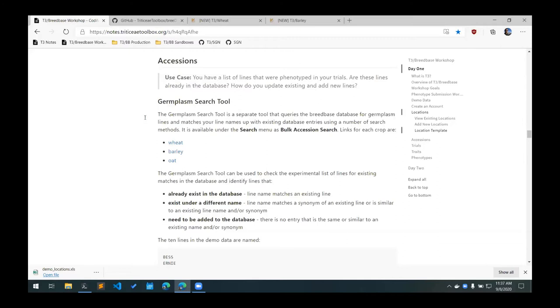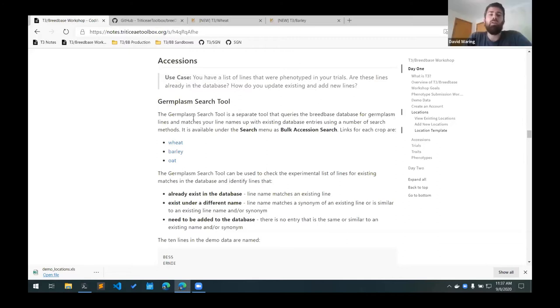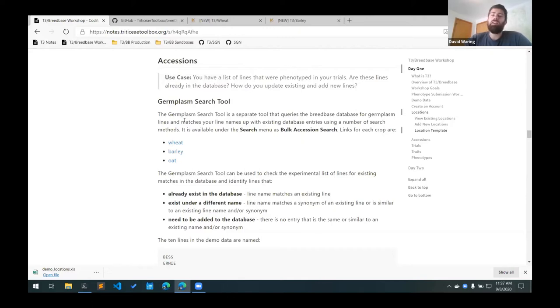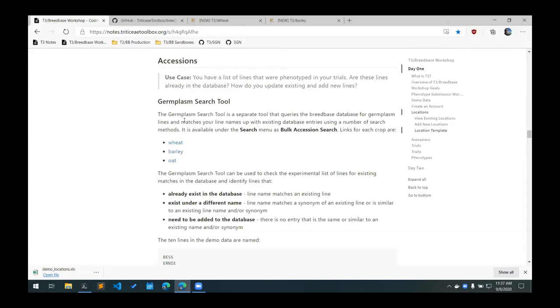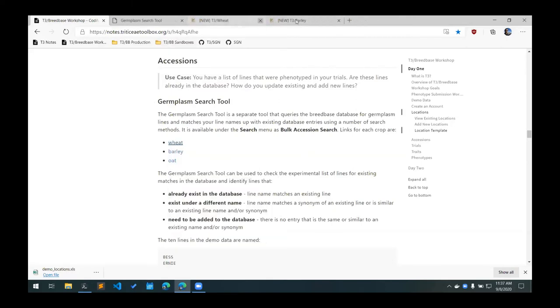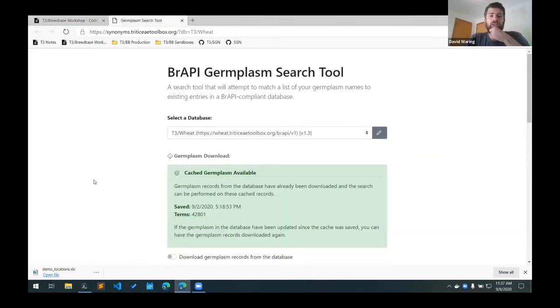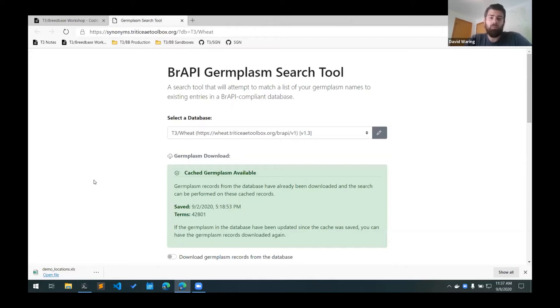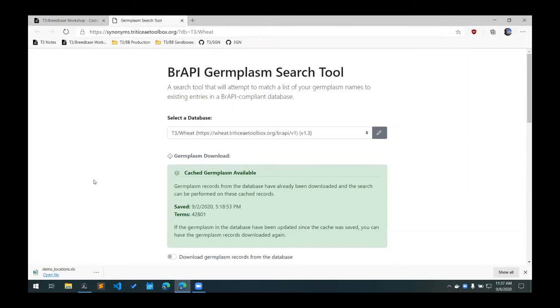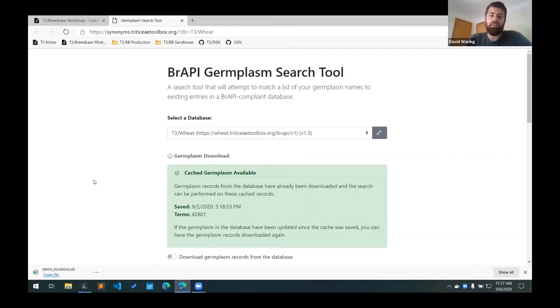One thing that we've been working on is creating this bulk germplasm search tool. We're hoping that this is an easy way to search a list of lines at once to see if they're in the database. We have links for each of the crops here. And what this takes you to is this page here. This sort of lives outside of Breed Base, but it works through an API that talks directly to the Breed Base database.